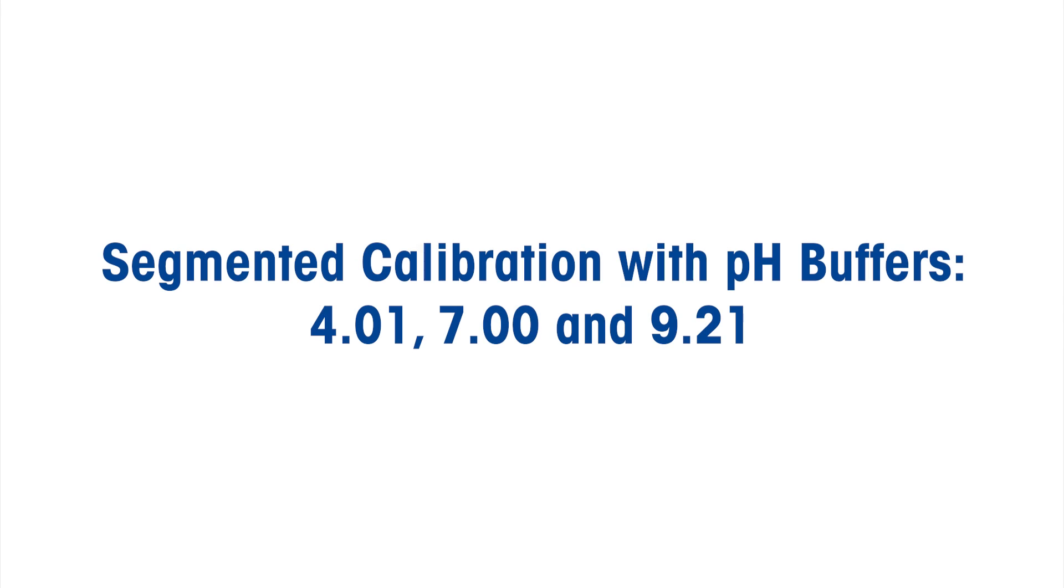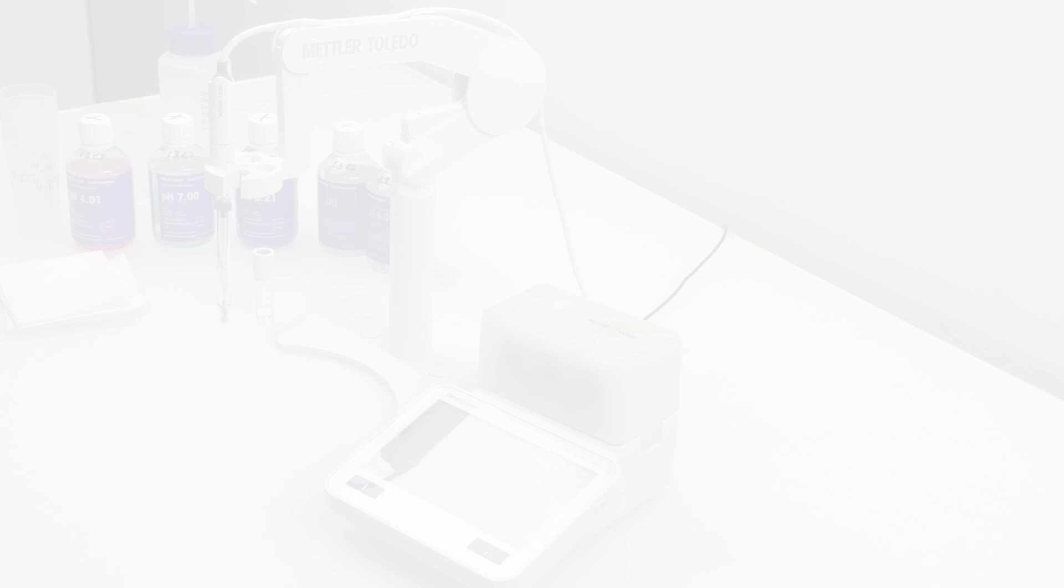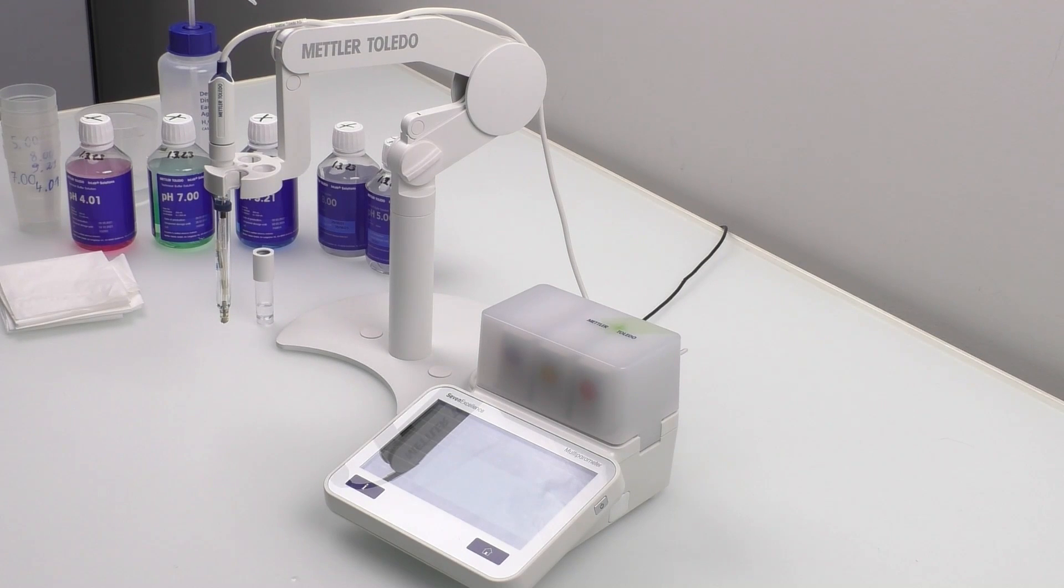Now, let's move on to segmented calibration with 3 pH buffers. To do this, we'll use the 7 excellence meter with the in-lab Pro-ISM sensor placed in the U-Place. For the segmented calibration, you will need 3 pH buffers: 4.01, 7.00, and 9.21. During calibration, be sure to rinse the sensor with deionized water and dab it dry with a tissue in between buffers.